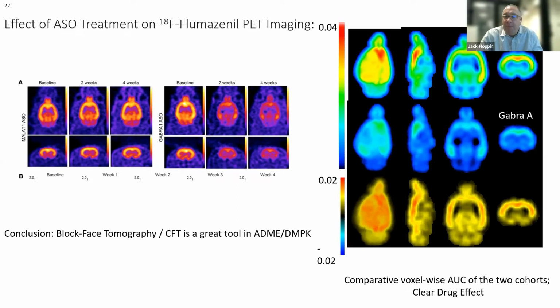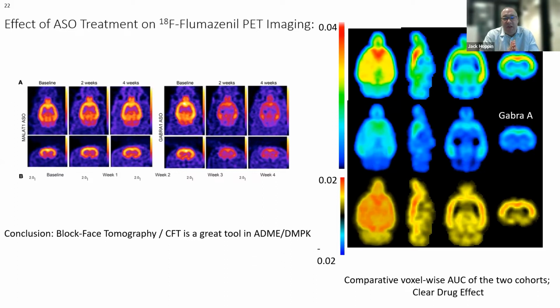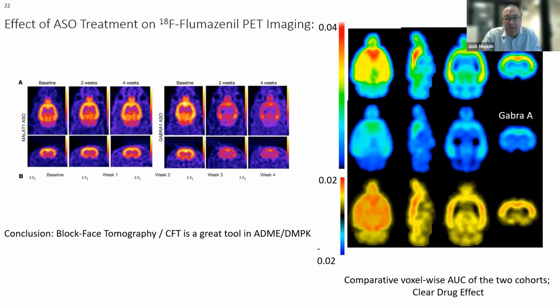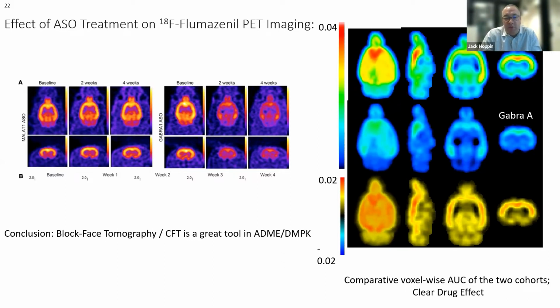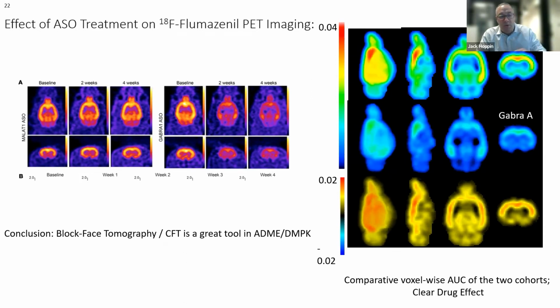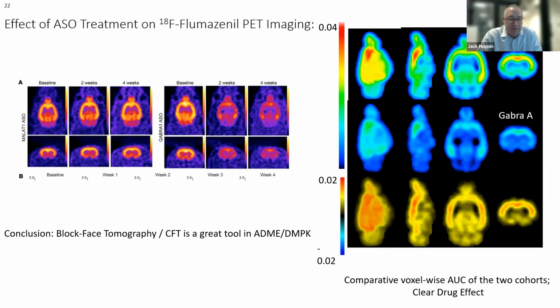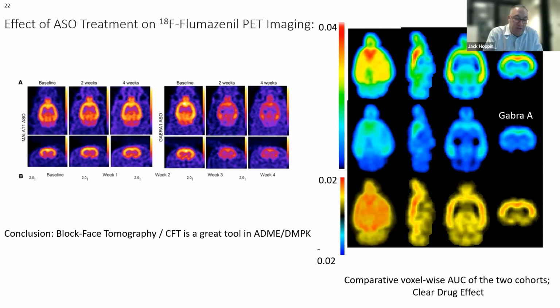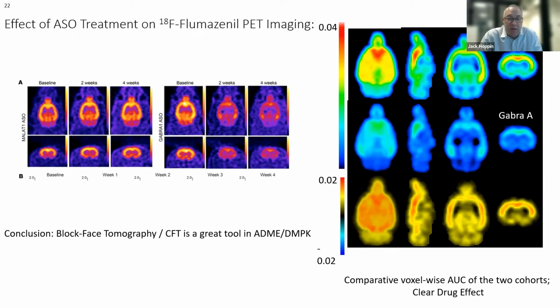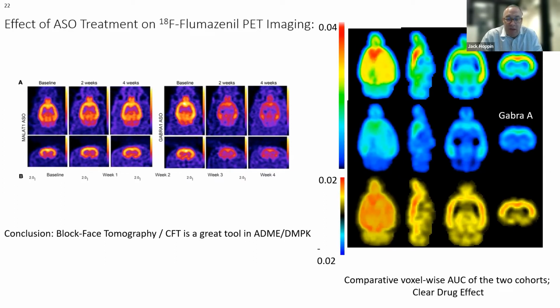So now I'm going to get a little more technical and frame CFT as to where it fits in the context of rodent imaging compared to other modalities. Out the gate, I want you to know I'm not a believer in one modality trumps all. That's often a hype that happens. It's just not the reality. I think, as we stated at the beginning, you need to understand all the modalities that one can have available to them, and choose the right tool for the right task.